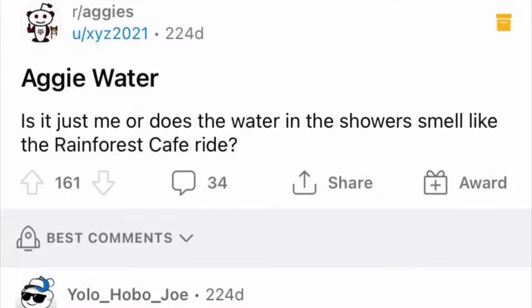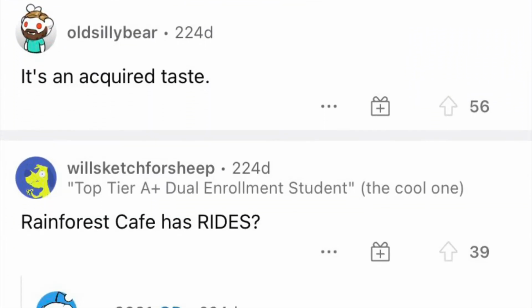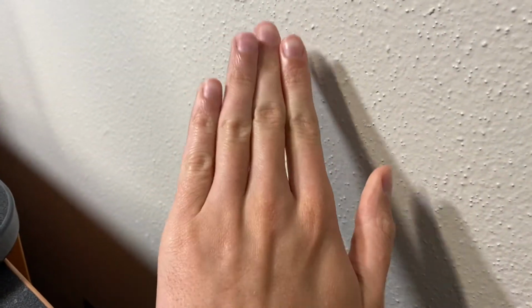Moving to campus this past year has been full of many surprises. However, none have come even close to that of the quality of the tap water here. Many students have expressed discomfort at both its flavor and texture, and I personally have found my skin becoming more dry after prolonged contact. So, after covering multiple pH units in chemistry, I was determined to get to the bottom of this phenomenon.